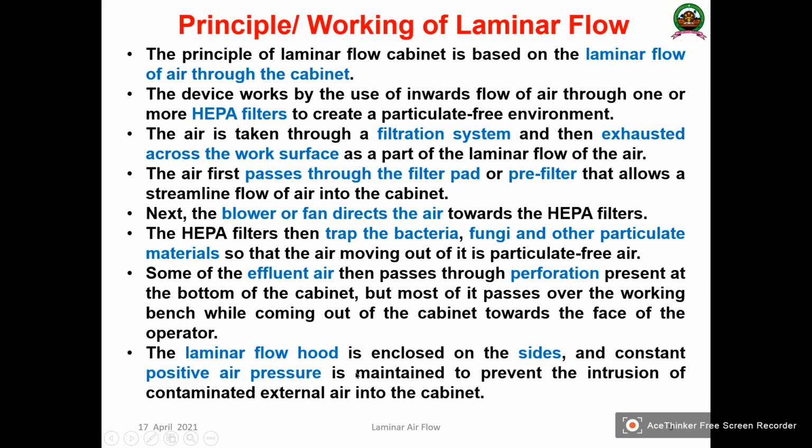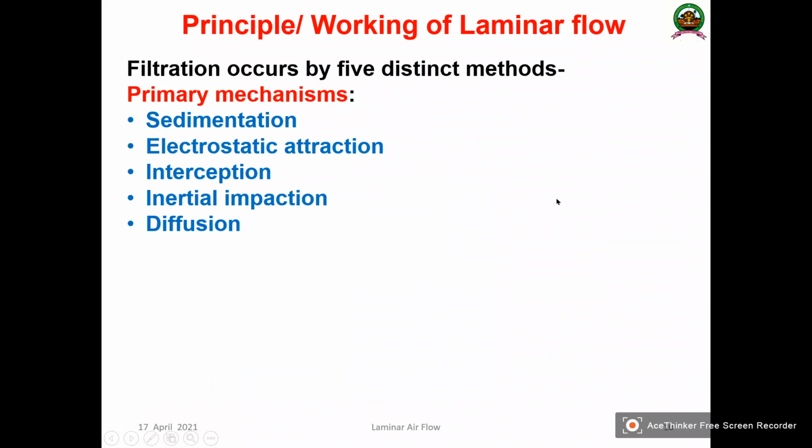The laminar flow hood is enclosed on the sides and constant positive air pressure is maintained to prevent the intrusion of contaminated external air into the cabinet. The primary mechanisms of filtration are mainly sedimentation, electrostatic attraction, interception, inertial impaction and diffusion.